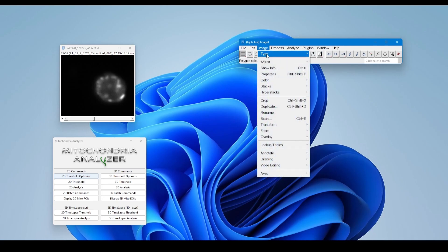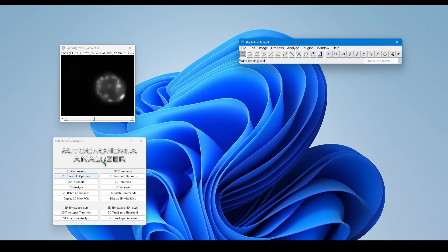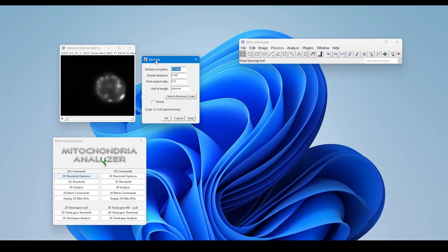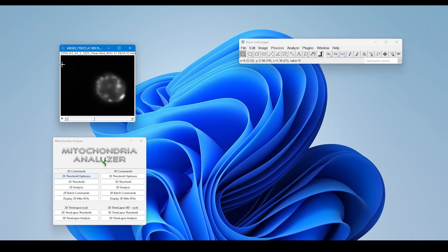To begin my analysis, I convert all of my images to 8-bit and then I set the scale. This is where you tell ImageJ how many pixels are within a micron. To be able to use the mitochondria analyzer, you have to set the scale to microns — you have to specify microns for the mitochondria analyzer to function. So again: 8-bit conversion and then set the scale to microns.